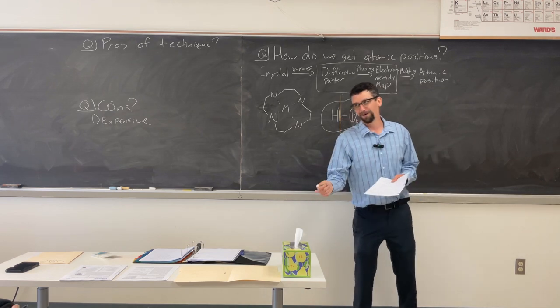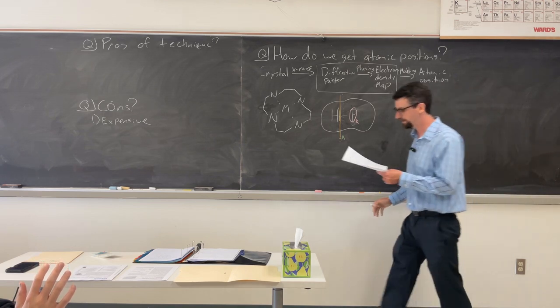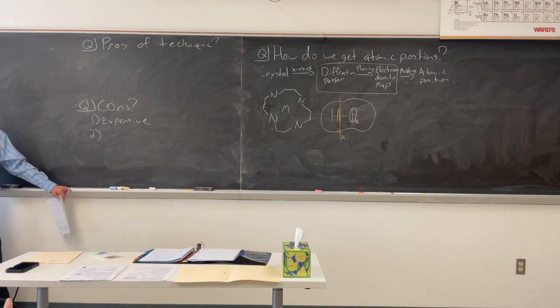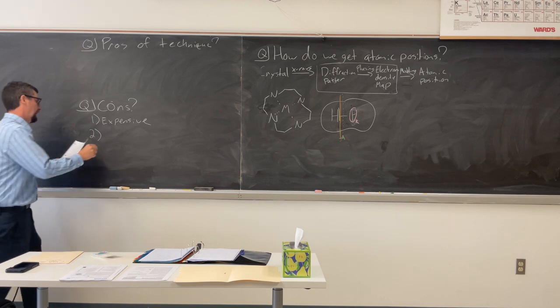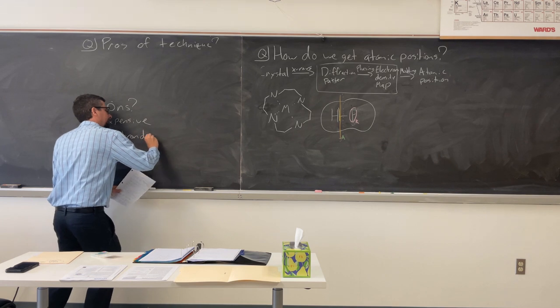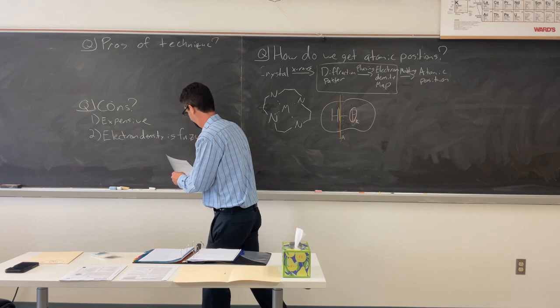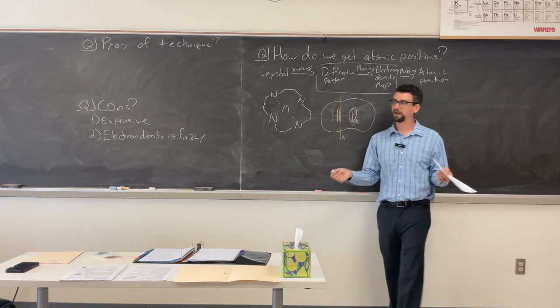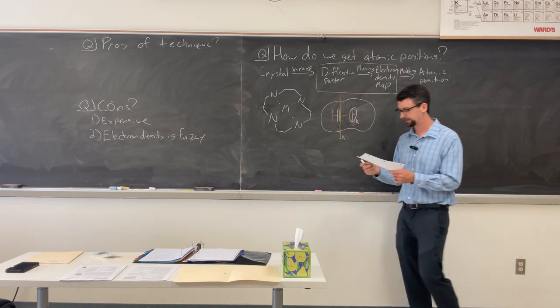Not so much anymore. It was initially hard. Now it's not too bad. It can have some difficulty. And when you say interpret, I mean, look at our diffraction pattern and then figure out how do I get to the structure. Electron density is fuzzy. Like our discussion here, where does one atom start and the next one begin? It's up to interpretation in different theoretical models in some cases.